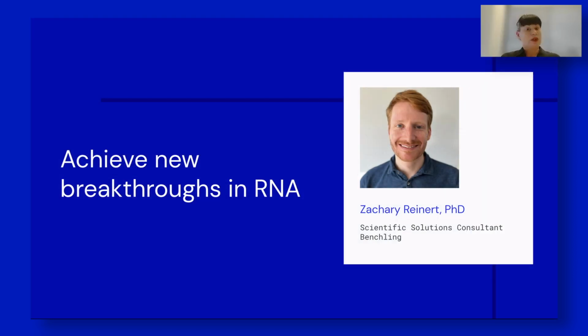Well, the past couple years have been challenging for us all. It definitely taught an awful lot of folks about the power of the work you all do. We couldn't have imagined that mRNA would be dinner table talk, but here we are. And RNA molecules are fundamentally changing our understanding of biology and how we address disease. And in talking to a whole bunch of scientists, I have learned that the tools that exist today for doing this work are incredibly limited.